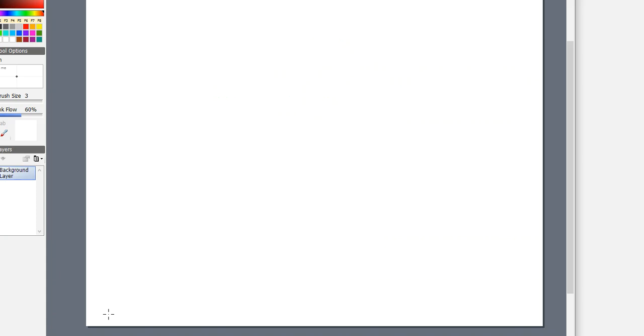So let's just kind of go ahead and get started. We need to talk about what TLC is all about, and I need to give you a rundown of the basics of TLC first, and then we can kind of sprinkle in some of the instrumentation along the way.